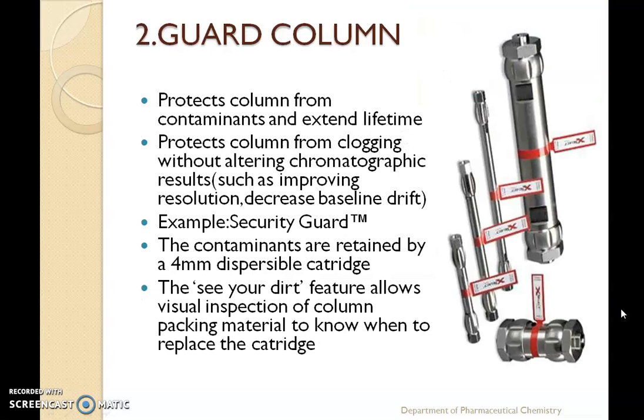Another important aspect in case of the column is that you need to go for the guard column. The guard column protects the column from contaminants and extends its lifetime. That is very important because the column is a somewhat costlier part of the HPLC, so you need to take care of this. Guard column is a must. It not only protects the column from clogging without altering chromatographic results, particularly with respect to resolution, but sometimes also decreases baseline drift. So that is the importance of the guard column. The contaminants are retained in a 4 mm disposable cartridge.